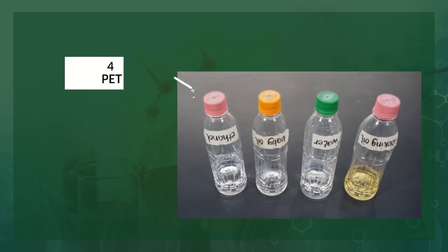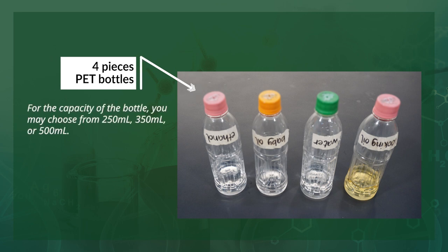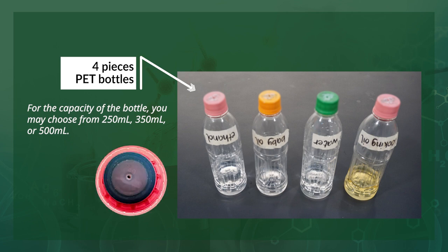Aside from the 4 liquid samples, we also need PET bottles. Since we have 4 liquid samples, we also need 4 PET bottles. Take note that for the cap of the PET bottles, we punched a hole in it. So each cap has a pin hole.